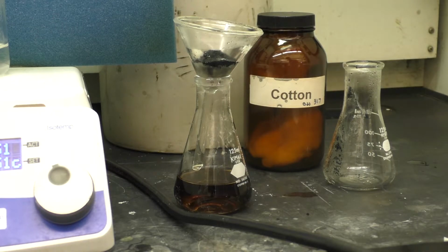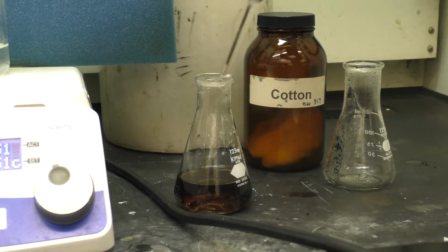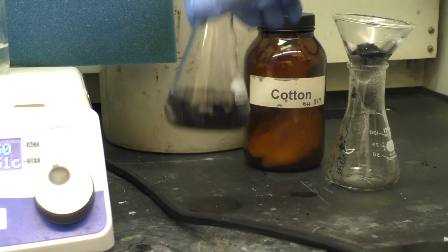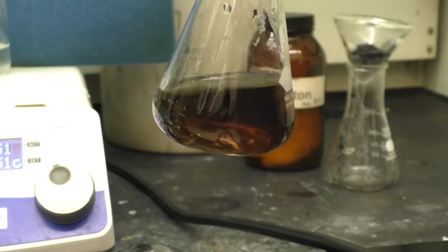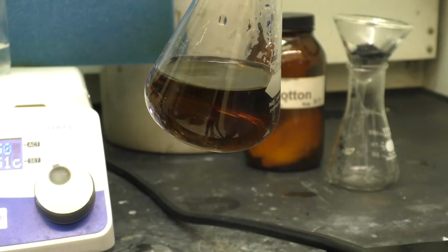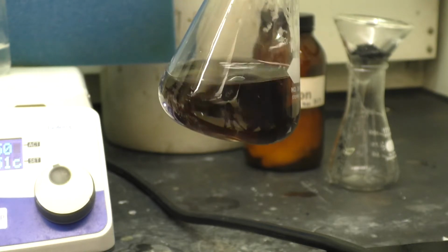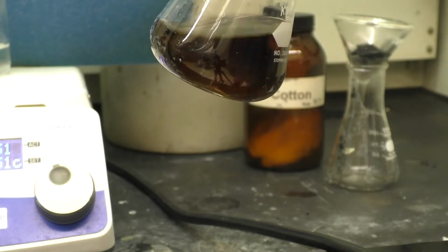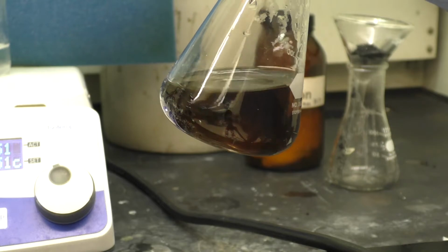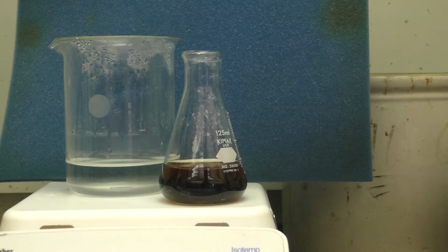So this solution is actually much improved relative to the last one. It's still very dark, but not nearly as dark. You can actually see through it a little bit more; it's more transparent. This is much more like tea. Certainly we could do this again another time, but I think this is now sufficient to carry forward. So now I'll go ahead and add the sodium acetate solution with some swirling.